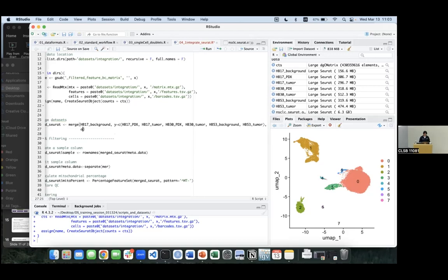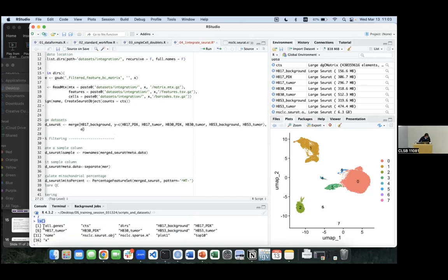add. Gonna quickly see what parameters we have so far. So we wanna assign the cell IDs into each treatment group or each sample. So it's start with the 4, 5, 4 to 10.